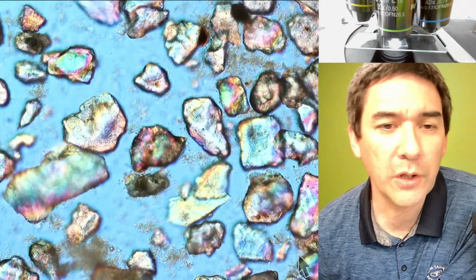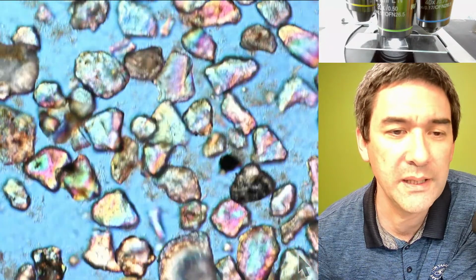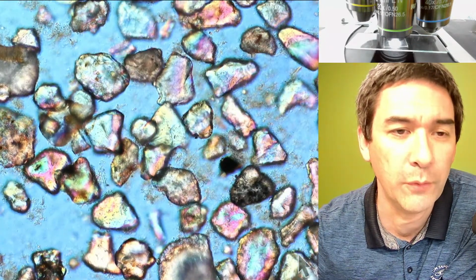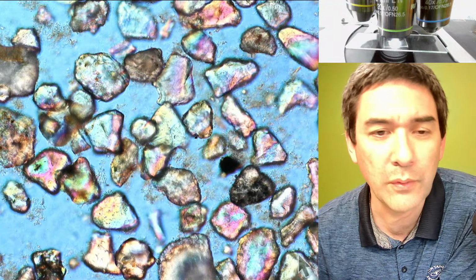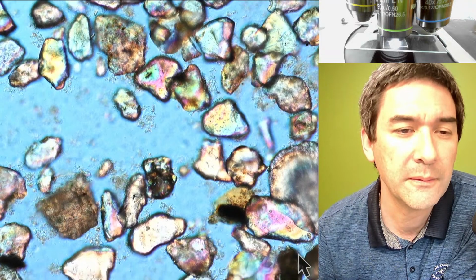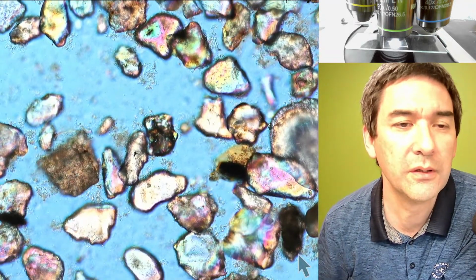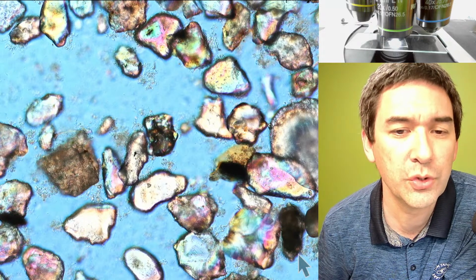What I have once done is I've taken a video over, let's say, several minutes, and then I increased the speed by tenfold in a video editing program. And this then allowed you to see movements that were otherwise too slow to be seen. I mean, look at this here. I'm going to show you.